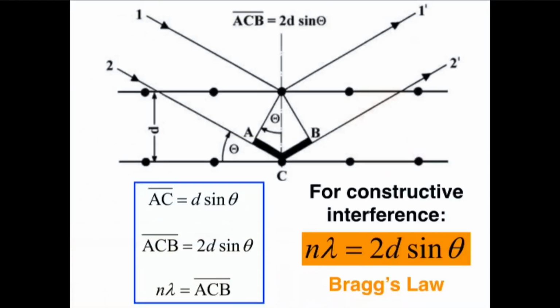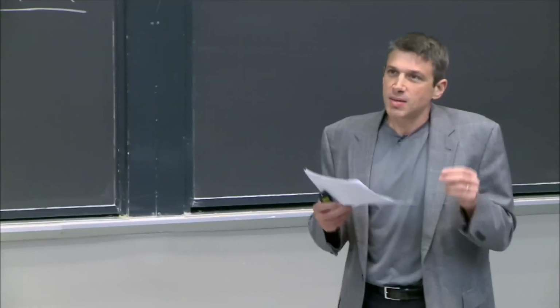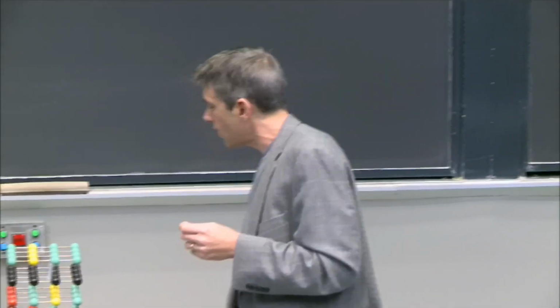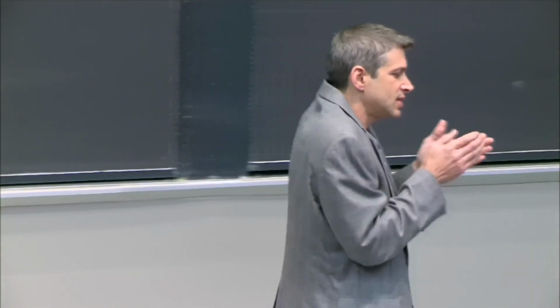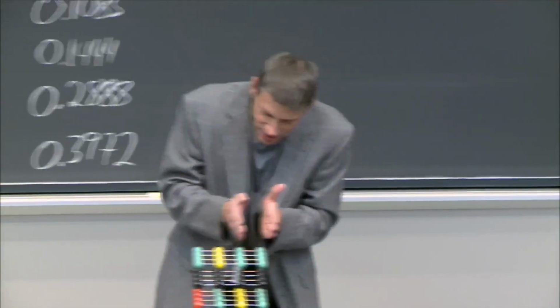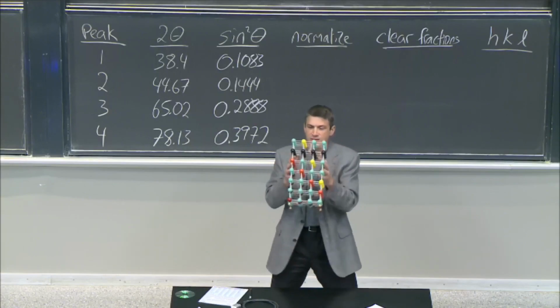Now, where were we? Oh, okay, we were here. On Wednesday, before we fill this chart out, I want to go back and make sure we get this, right? We talked about the Bragg condition, and how the unique thing about X-rays is that their wavelengths are right in that sort of precious distance regime of the spacing of atoms in a crystal.